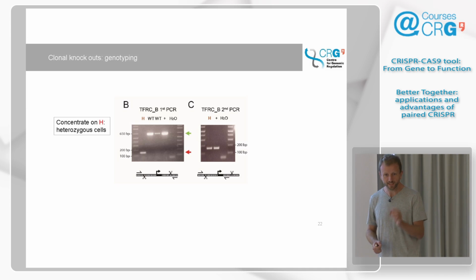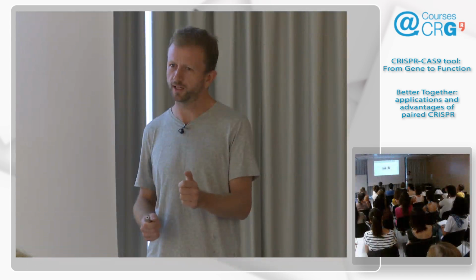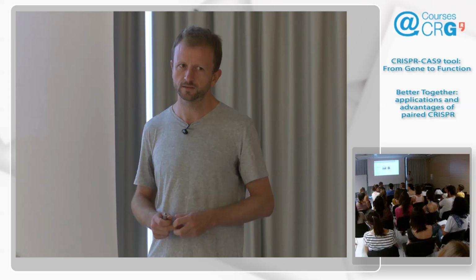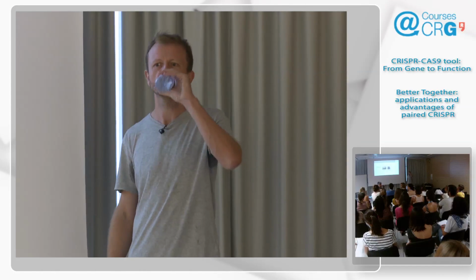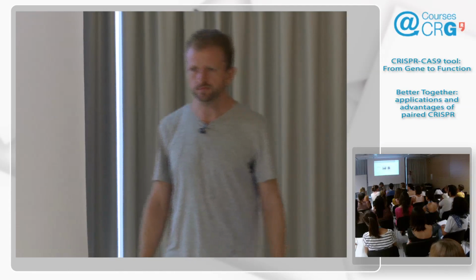Another good question. In the beginning, we used to purify the genomic DNA, and then we realized that you can just take an aliquot of cells and put it directly in. Or do you lyse it first, Estelle? You just lyse it with a buffer. In the paper, the buffer composition is written. You just boil them and make them explode, and then do the PCR.